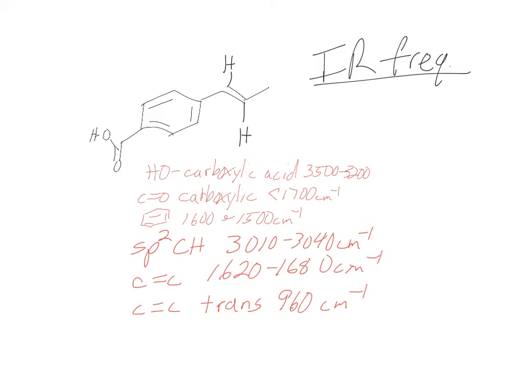All right, I see one more functional group left that we haven't talked about. There's sp3 CHs. Don't forget about those. So sp3 CH, and where are those at? Always less than 3,000 though. They're never above, so 2960 to 2850, but never above 3,000. If there's something above 3,000, it's not only an sp3 CH. It's probably sp2.